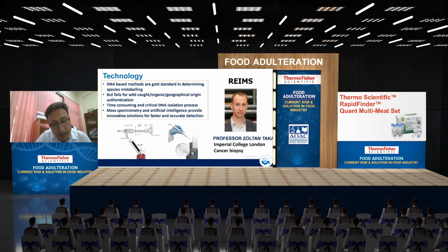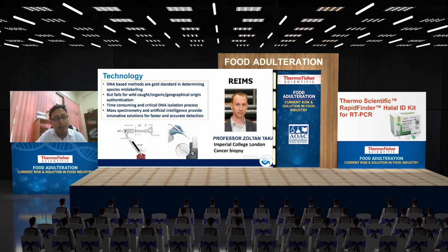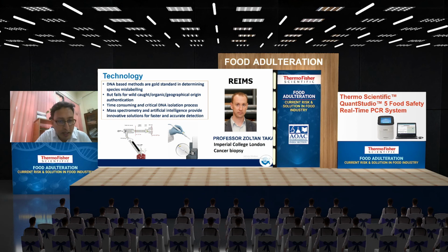So another type of mass spectrometry technique will be the ambient mass spectrometry technique, where you don't have a front end LC. The ions generated from the product directly go into the mass spectrometer. REIMS will be an example. Other than REIMS, there are different types of ambient mass spectrometry techniques like DART, then you have paper spray mass spectrometry, etc.